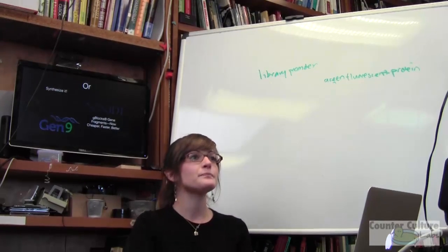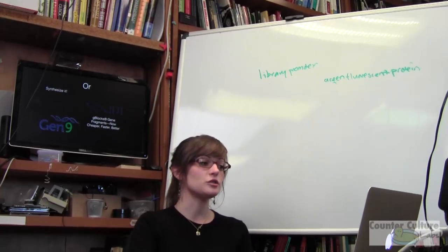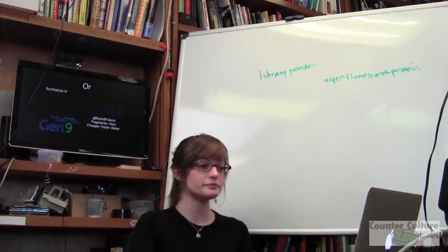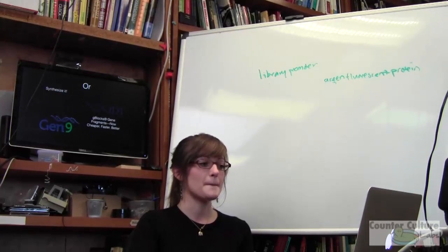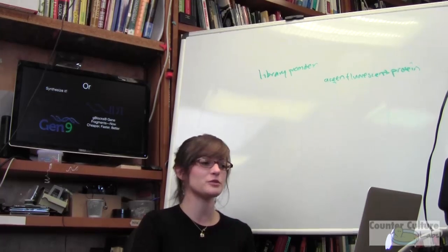Do any of these synthesis companies deliver DNA that's already in a vector? They do. You can get Gen 9, you can get it in a vector already. I'm not sure about the gBlocks, I don't think so. I could be wrong about that, though, so it's worth looking into.